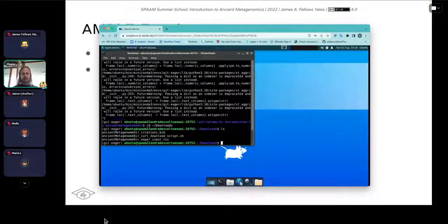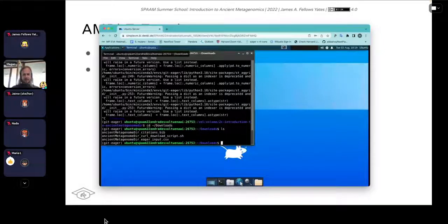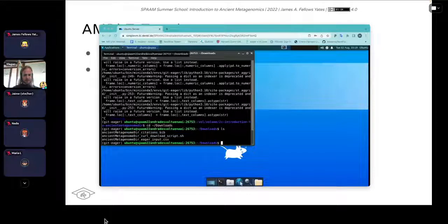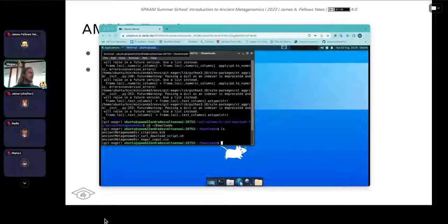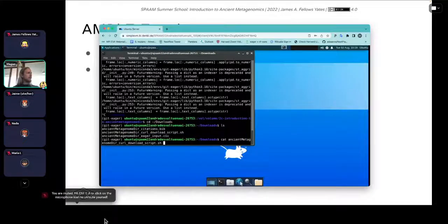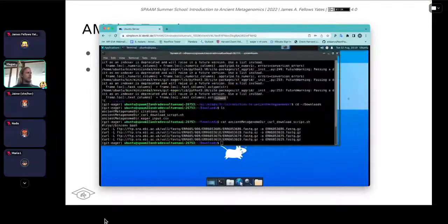You should see the three files you downloaded. Now I'd like you to cat the curl download script: 'cat ancient-metagenome-dir-curl-download-script'. You should see a script like you were looking at yesterday. Does anyone remember what the thing at the top of your script file is called?